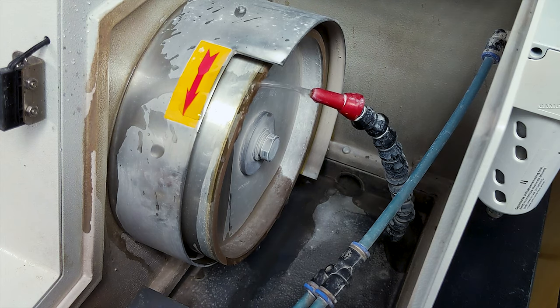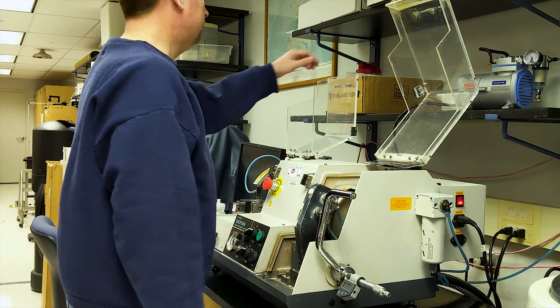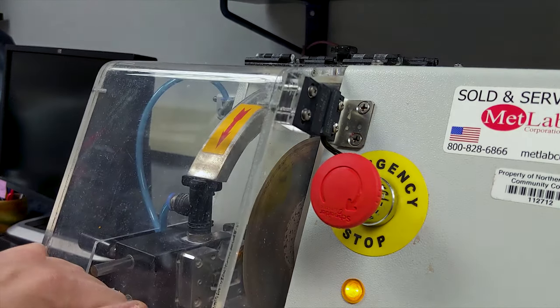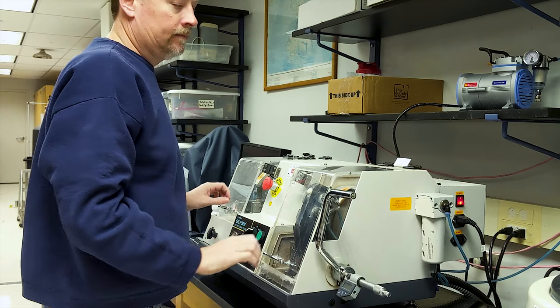Turn on the water, and when we're ready to begin cutting or grinding, both splash guards must be lowered before the cutting and grinding motor can be activated. A magnetic safety switch on both guards must be aligned for the motor to work.